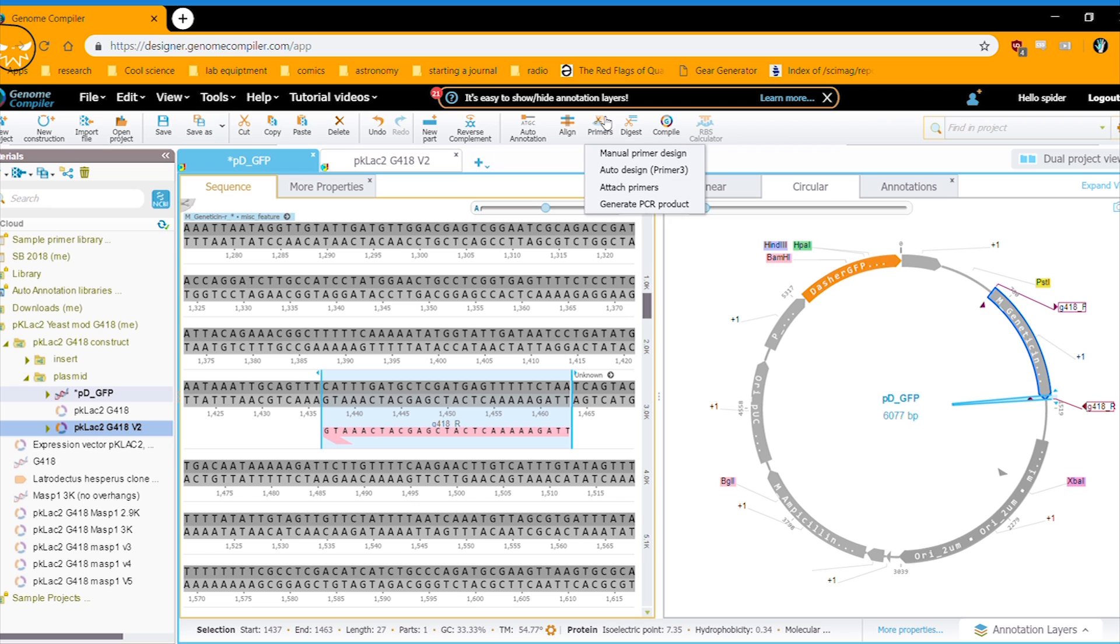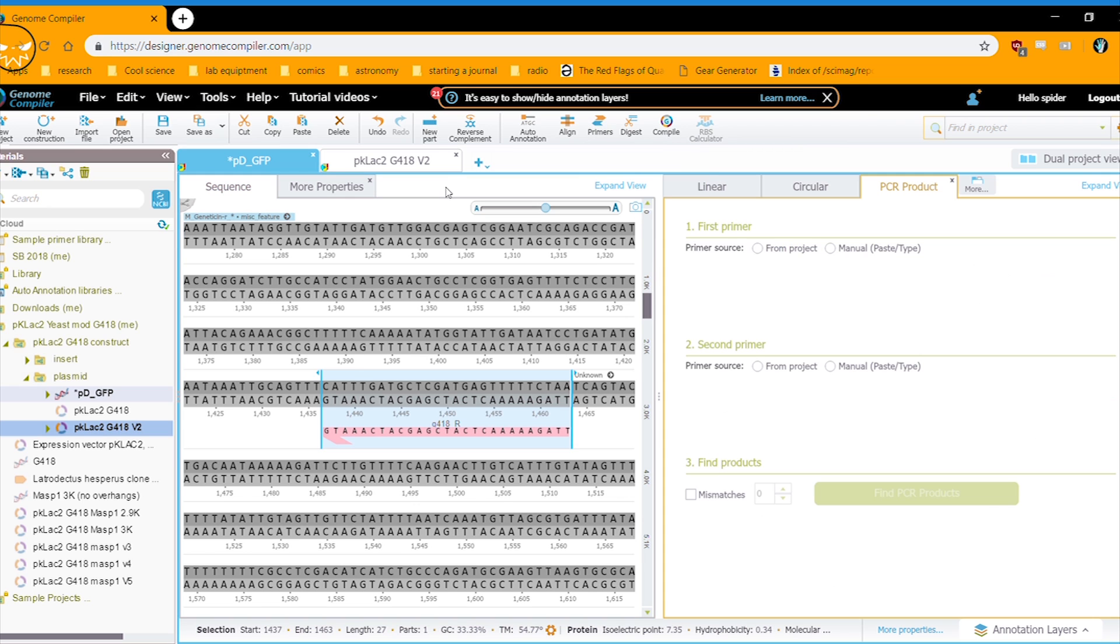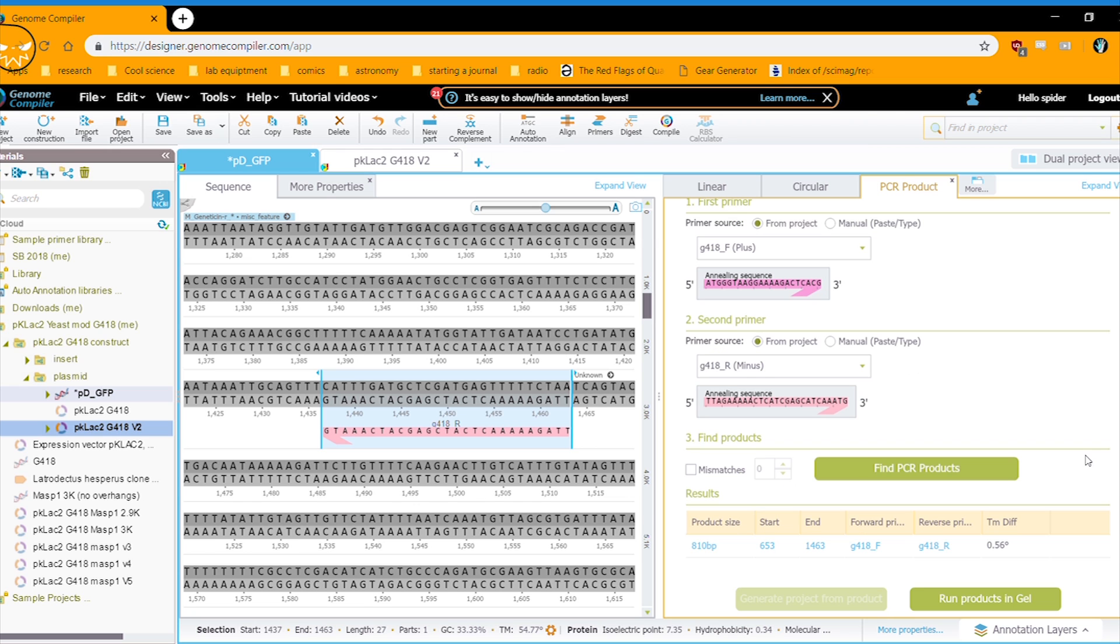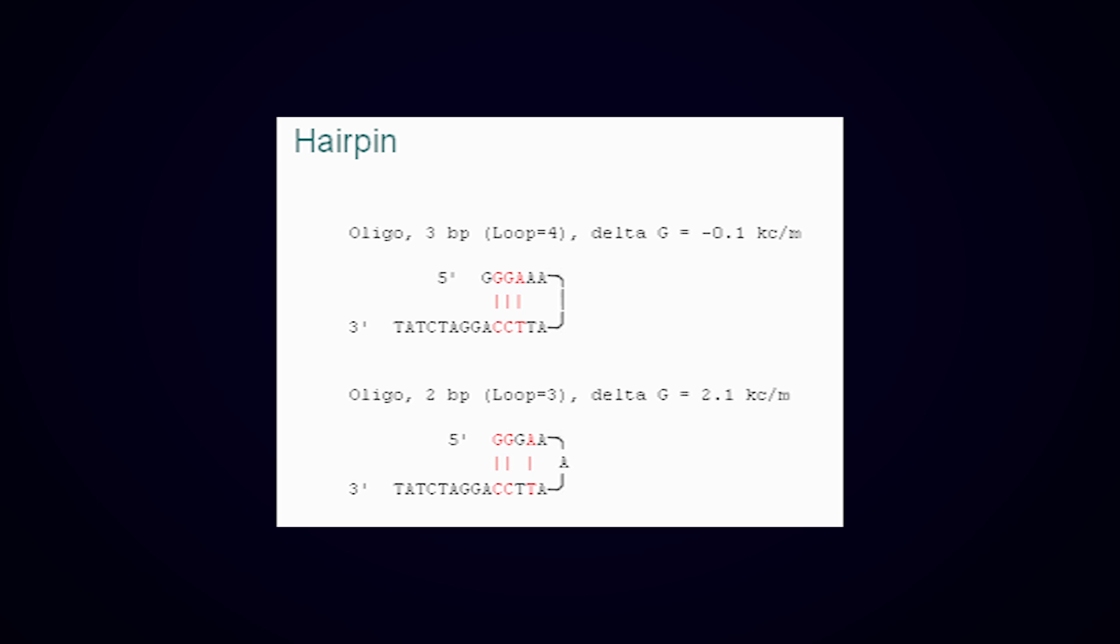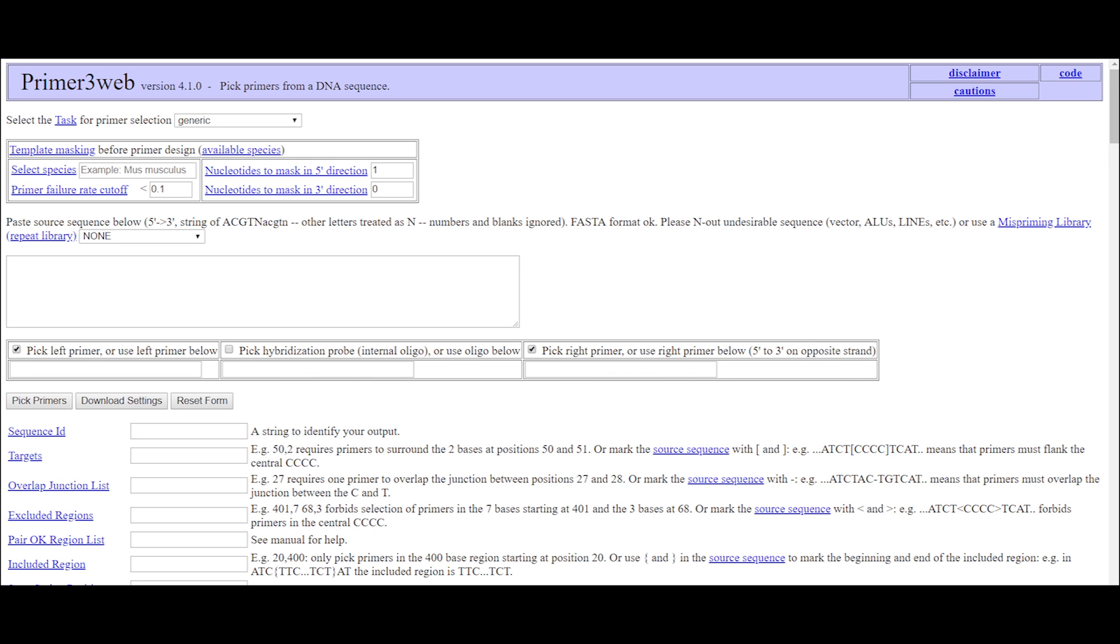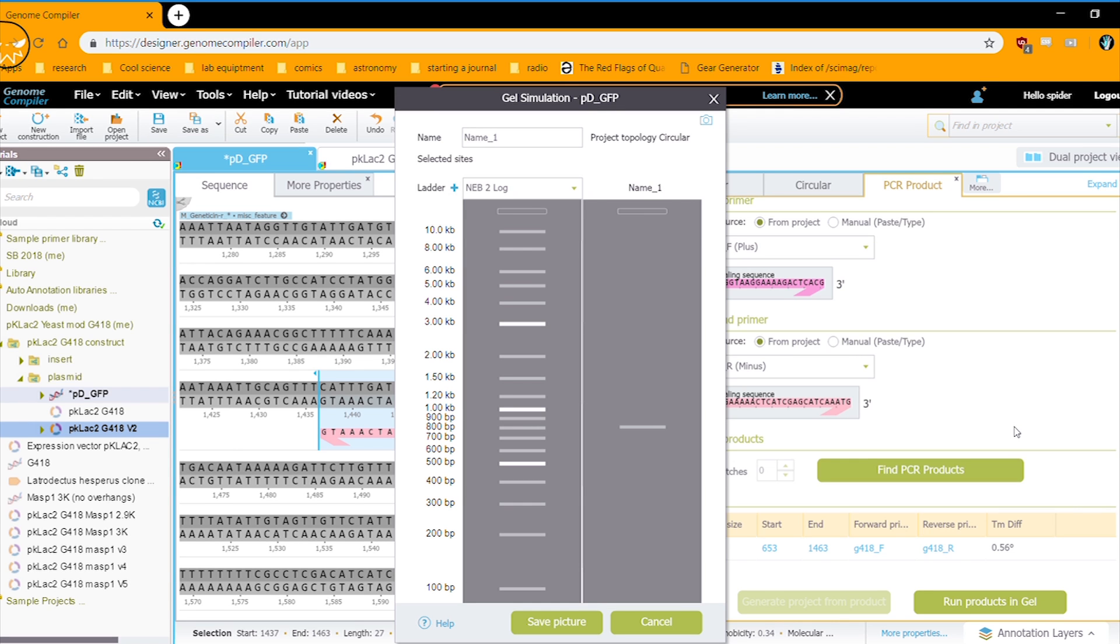Once that's done we can simulate our reaction by going to the primers menu and clicking generate PCR product and selecting our newly designed primers. The reason we do this is because sometimes when you design primers they can accidentally stick to something they're not supposed to if they're too similar to another sequence. Or they may stick to each other and form what's called a primer dimer. Both of these are bad, so by simulating we can essentially check and make sure that won't happen. Another thing that can go wrong is a hairpin, where the primer can bend back on itself and stick to itself, making it totally useless. Genome compiler doesn't check for most of this, but it does give you the option to be redirected to a site called Primer3, which does. But when we ran ours it shows only a single perfect product.